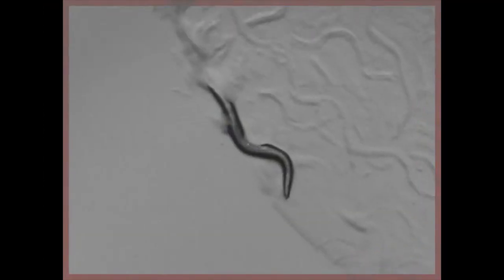So here's a worm on agar. The red dot in the middle is where the vulva is positioned in the worm and the egg appears near the red dot.